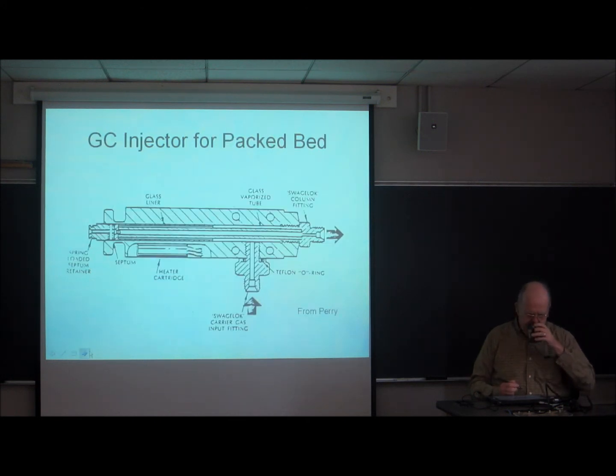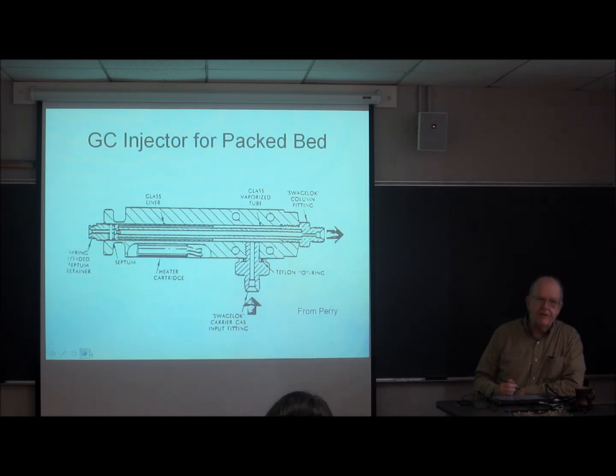Okay, this is a GC injector for a packed bed. It is a little bit complicated, a little bit.